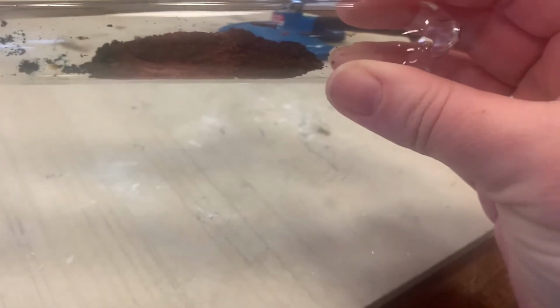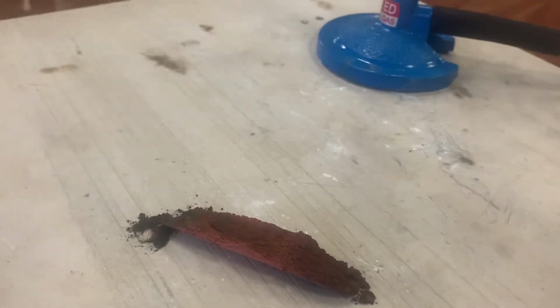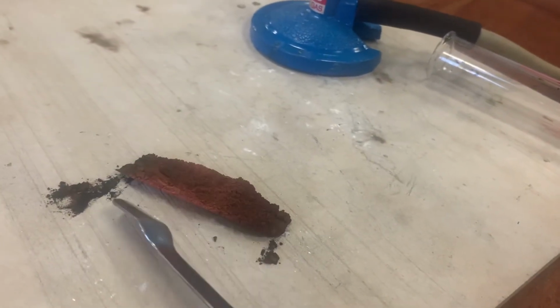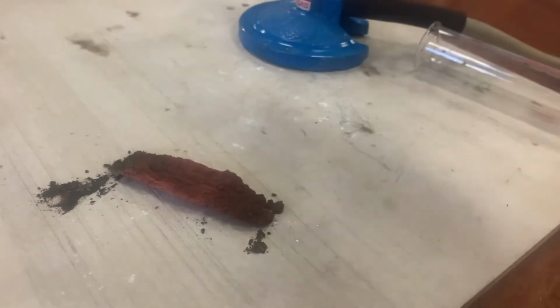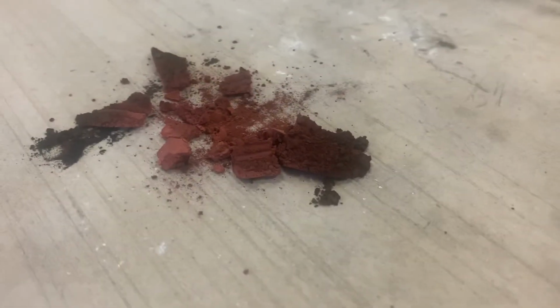Okay, so I've let it just cool down. And just taking the stopper off the tube, so hopefully you can see that it's gone a bit orange, and underneath it definitely has. And if we tip it out onto the safety mat and have a look at it, so remember it started as an all black powder. You can still see some of the black powder, it hasn't reacted, but then I'm going to give this a tap, so you can see it's definitely reacted. It looks really good, an orangey brown colour of copper.